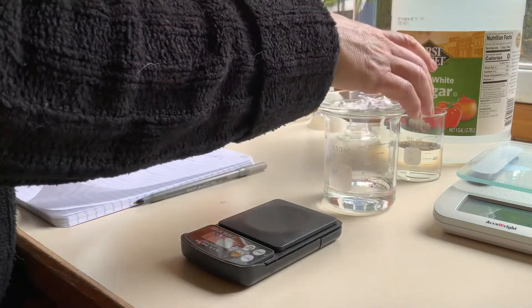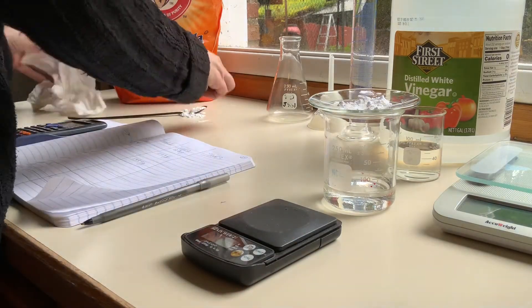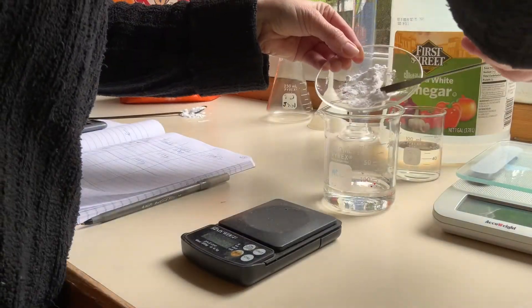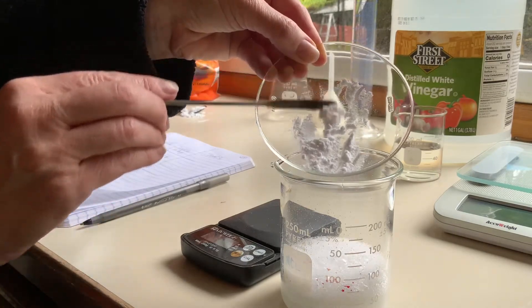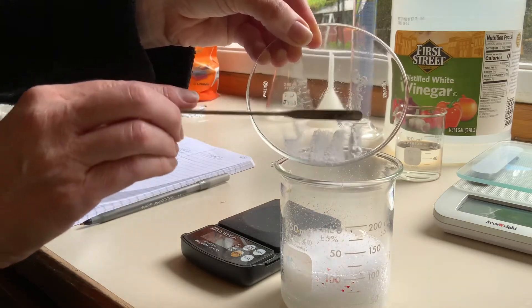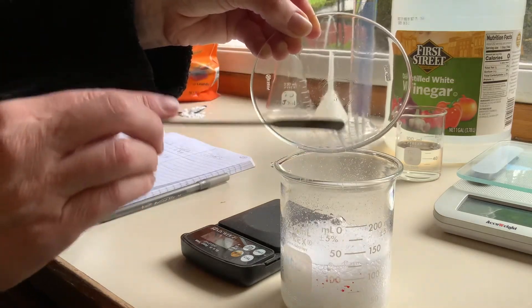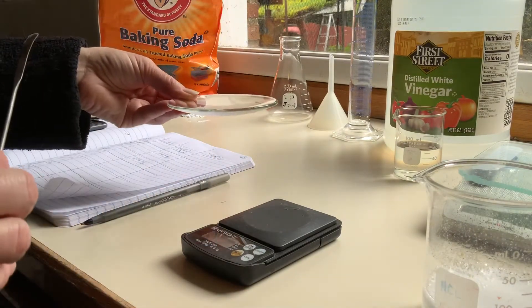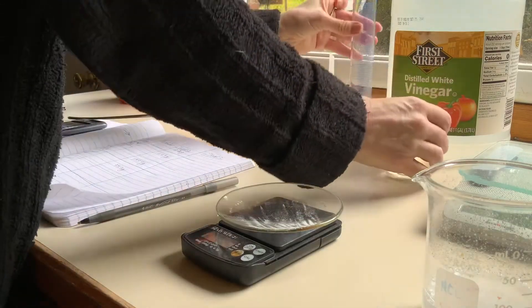In the instructions we'd weigh them all together, but that exceeds the capacity of the scale. So I'll go ahead and do the reaction — making sure my little scooper is clean and dry — and put the baking soda in there. While that's reacting, I'm going to weigh the watch glass after. Watch glass after is 55.7 grams.